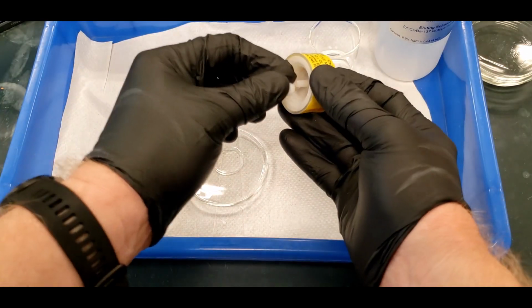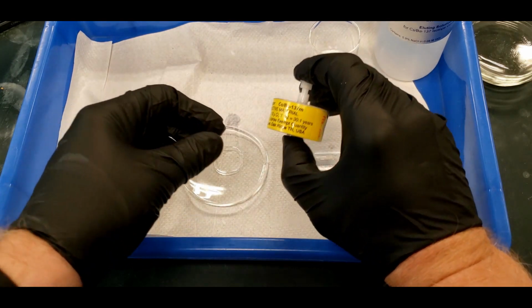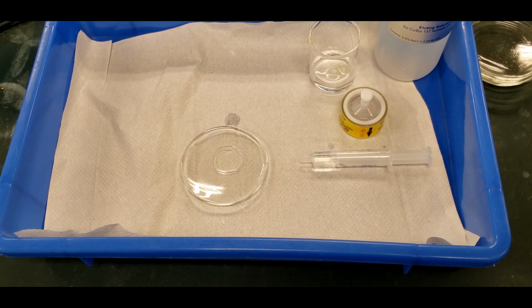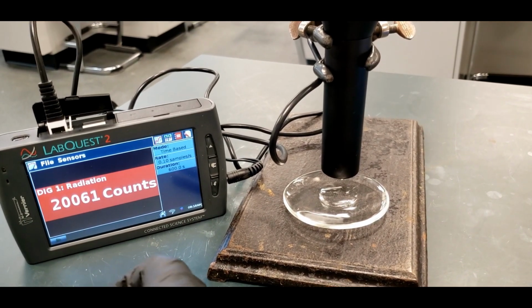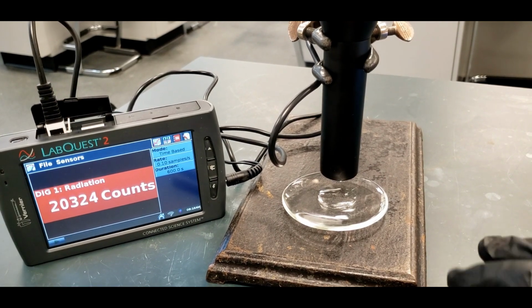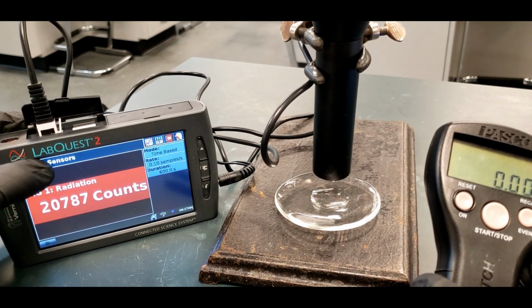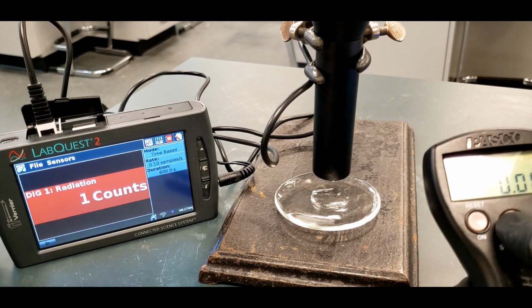And the thing is that the half-life of the barium is less than 3 minutes. So in the time I do this, make sure everything's put away, it's going to take me probably 1 half-life to get this over to the radiation counter. Okay, you can hear it going, and I'm going to set it up, and I need the timer. So, turn that on, and what I'm going to do is reset it, and new, and start this.